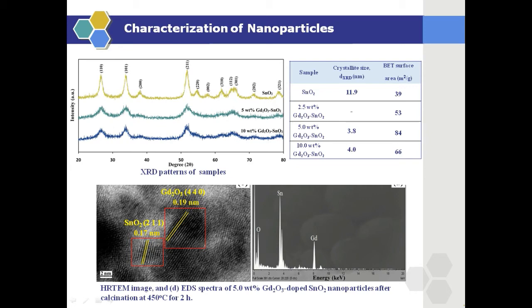Here you can see the XRD and TEM results of pure and gadolinium oxide doped tin oxide nanoparticles. By addition of gadolinium oxide to tin oxide, the main XRD peaks broadened. In addition, the average crystallite sizes of nanoparticles decrease. This indicates that the presence of Gd ions in tin oxide inhibited the growth of its crystallites.